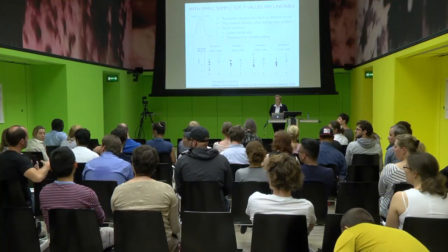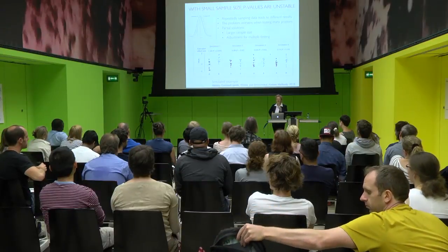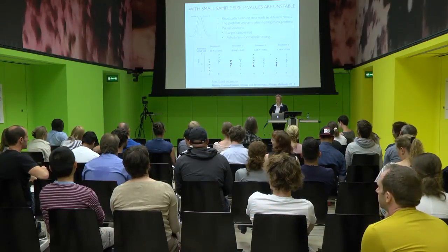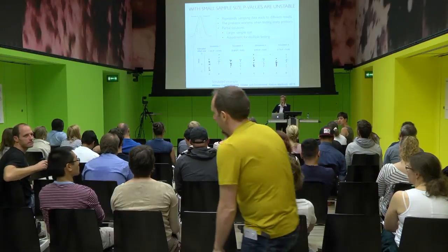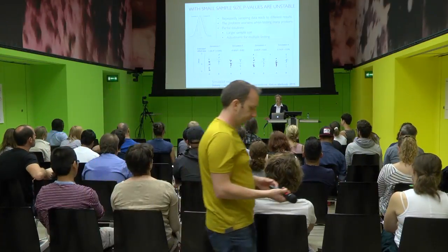Is there a way that you can compute the fold change that you can detect with a certain number of replicates? Yes. That will be towards the end, and if we don't get to it, we will talk about how to do it in MSstats. But the thing is, sample size calculation is part of the experimental design, and so this is something you do obviously before collecting the data. The problem is that you need to know a lot about your experiment to do this. So we'll work through one example data set, and then I will take it all the way back to the design and how we can talk about sample size calculation.